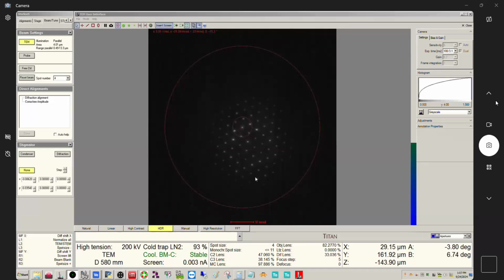The nice thing about using the tilt trick is if you have the tilt purity, that should be taken care of. So, well, now I'm a little paranoid. So here, let me go back here. You can adjust it. I wouldn't do it with the beta, but you could make an adjustment with the alpha tilt, a small one here. So I'm going to go ahead and do that. Yeah, so that's a minus alpha adjustment that I made. Okay, so that's really close, and I haven't even adjusted the beam tilt here.